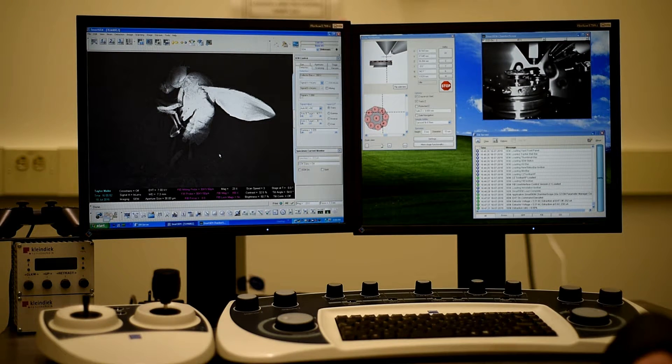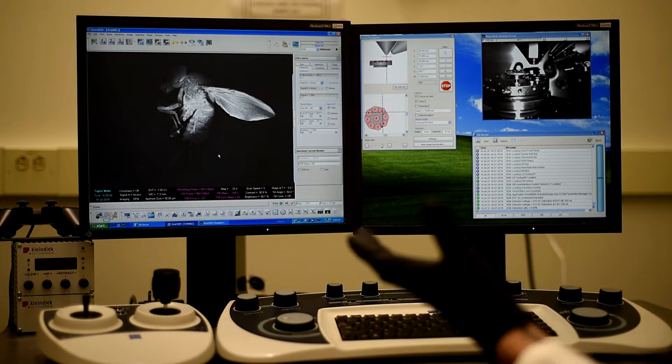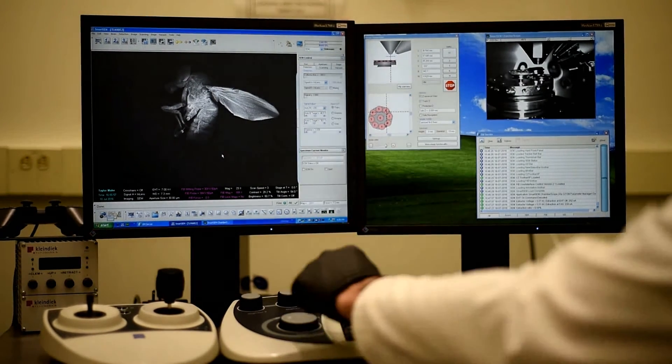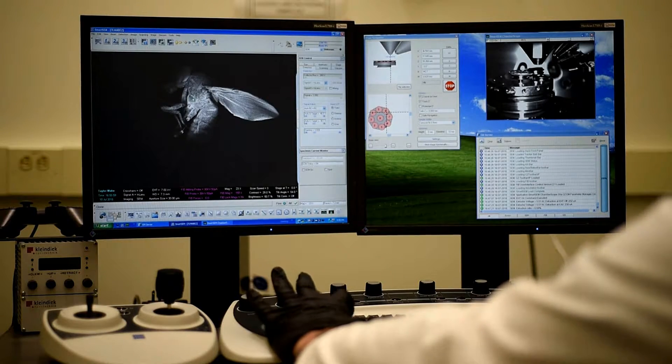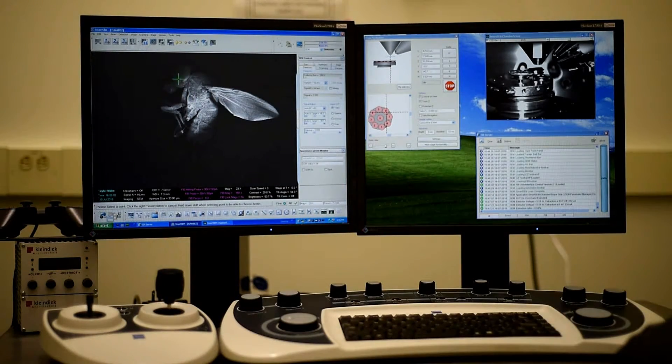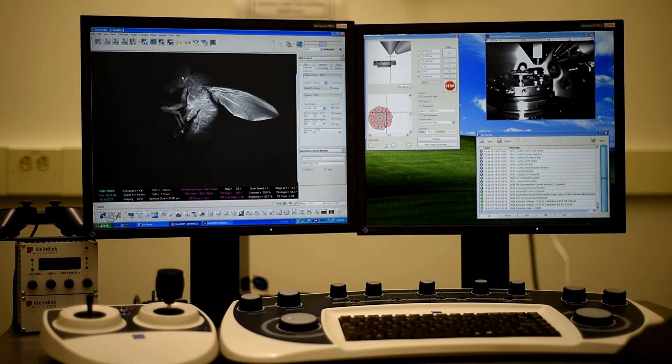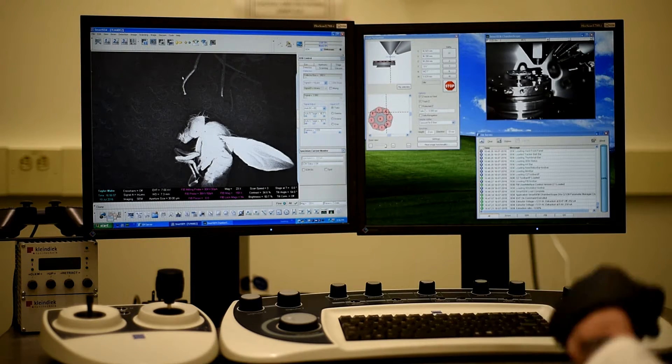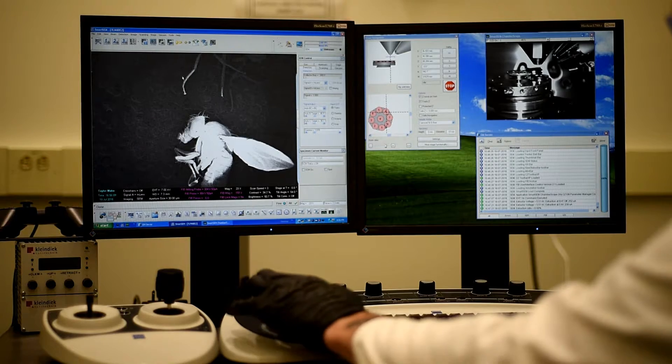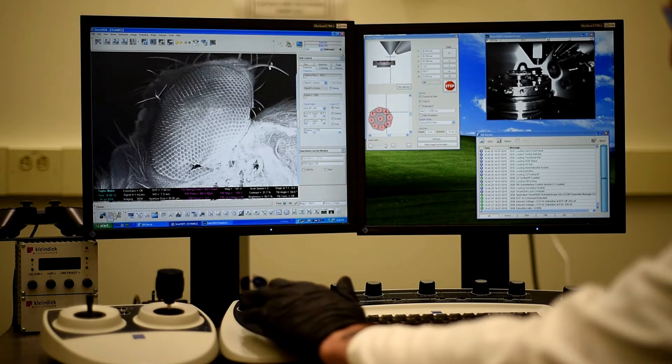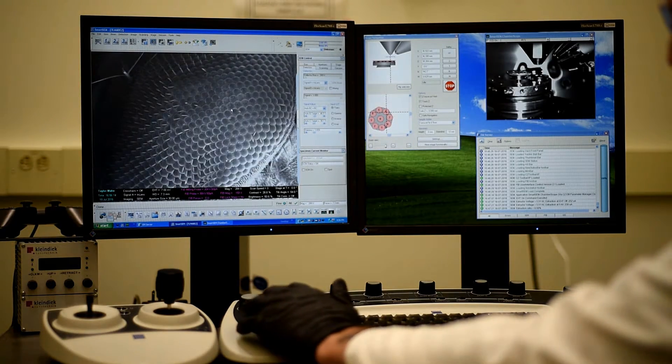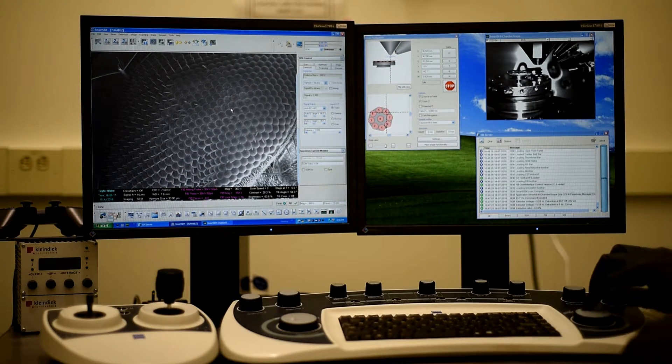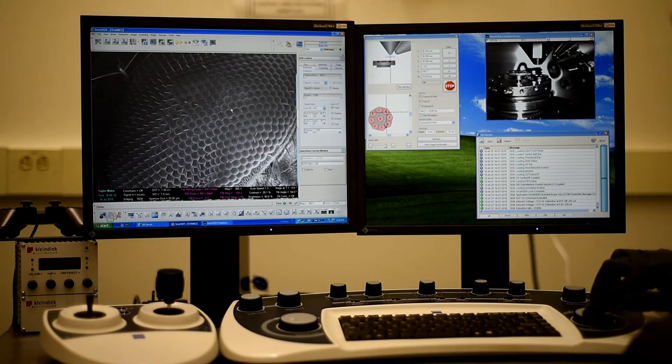So say we wanted to zoom in at a certain position. A shortcut I use quite frequently is control-tab. So if you hold control-tab, the cursor turns to a crosshair. And wherever you click is now the new center point. So that's a way to center relatively fast. So let's zoom in on this guy's eye. We can increase the magnification quite a bit. And we'll adjust our focus to make sure it's a little better.